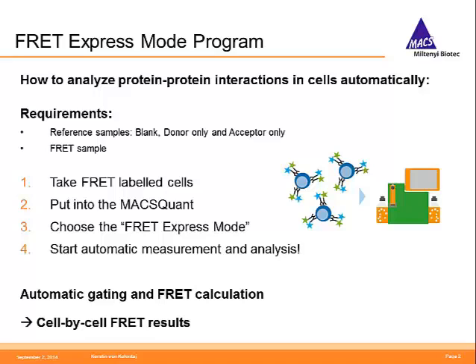So finally, the program produces results for FRET. They're really based on a cell-by-cell basis. So you have a FRET result for each single cell you analyze in your high-throughput screening.